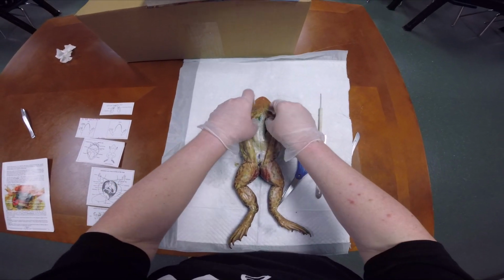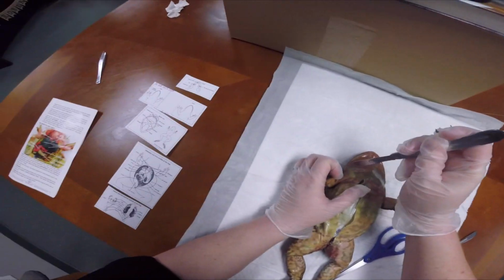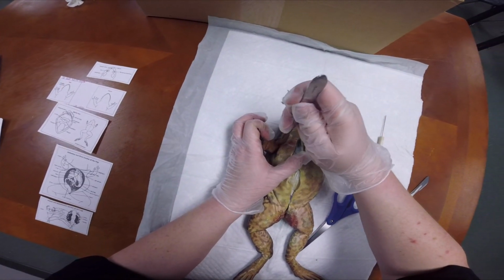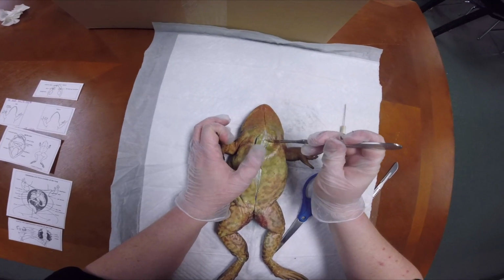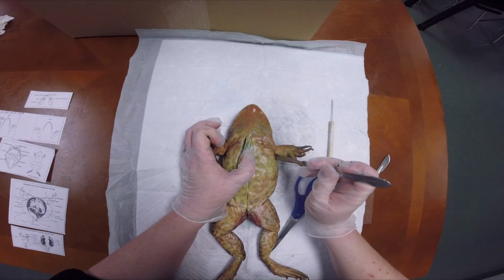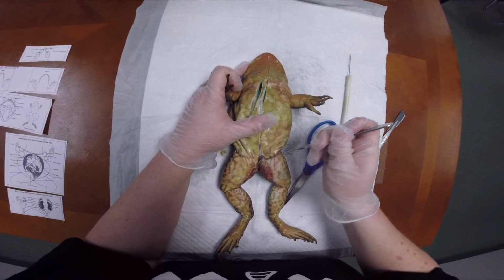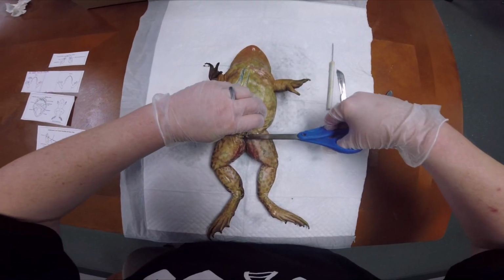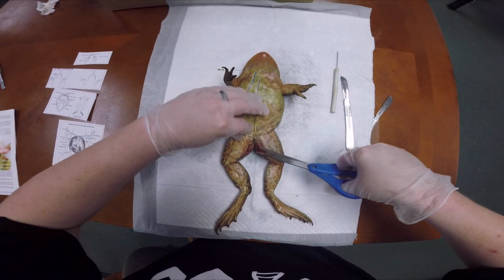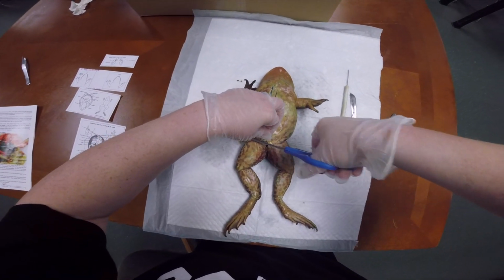And then you will take and cut from arm to arm, right here, all the way across to there, and then you want to cut the legs from there up there. Okay, and then I'm going to bring in this guy. Especially when you have muscles that you need to cut through, you're going to want the scissors.